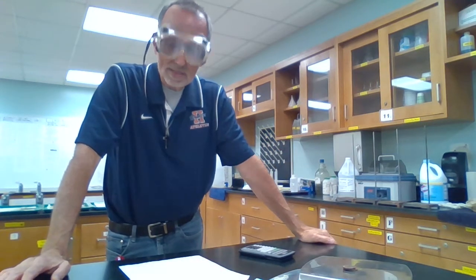2 pennies takes us to 5.03 grams, 5.03. 3 pennies, the mass is 7.55 grams. As I look over at set A, 3 was 9.26 grams. Now we're only at 7.55.